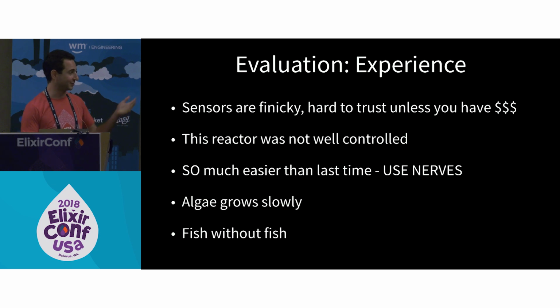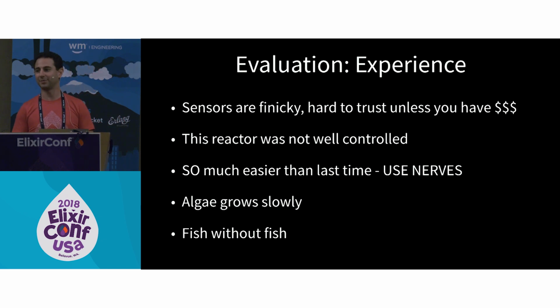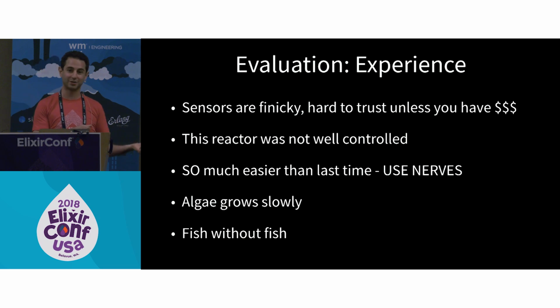The last thing, this comment, fish without fish. Algae has a special smell, and so I really recommend you do this in a well-ventilated room or outside. I was lucky, I had friends, and I was at places where I could do this in a well-ventilated area, but it's a very tricky thing to control because it's something that this thing naturally does. There are papers that say you can change the smell by changing the nutrients you feed it, so maybe there's something there. Hopefully there's other ways to improve it.